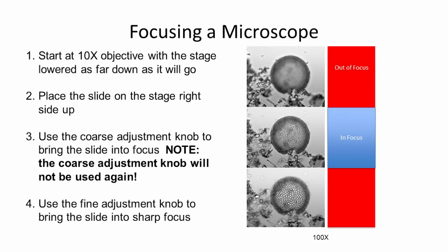Now, focusing the microscope is very tricky for the first time, but you guys can get it. It is an important skill to have, so make sure you work hard on that. Whenever we're focusing, we're looking at a plane or a slice of the thing that we are looking at. And because even bacteria are three-dimensional, we can put parts of them out of focus and other parts in focus.